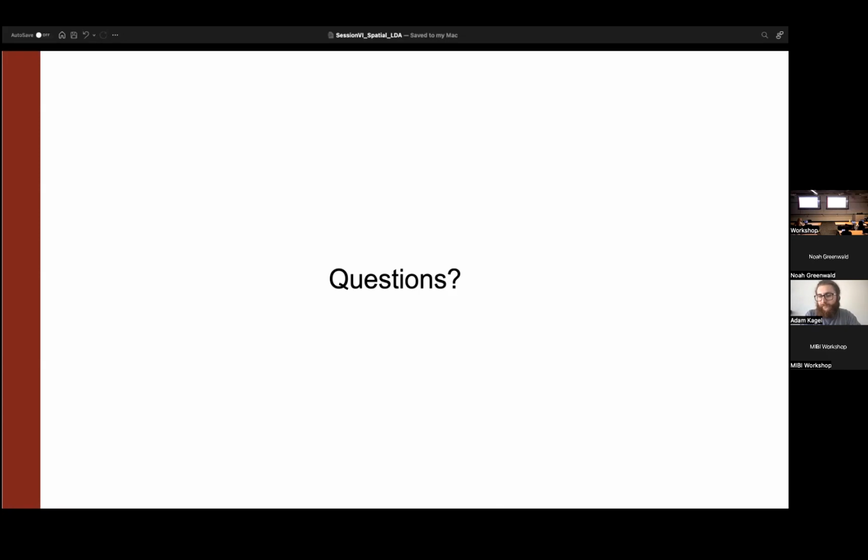One thing: as soon as Barbara's talk ended, we came up to her like, let's try this out. The spatial dimensionality reduction she talked about had a lot of the same benefits of this, where you have a smooth interpolation of different classifications. And that is something that is scalable. So if we try that out and it looks promising, it will definitely get imported into ARC so that it can be easily used. But yeah, out of luck if you want to do spatial LDA for that in its current form. You can always subsample. You could chop it up.